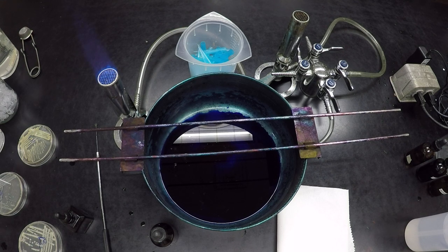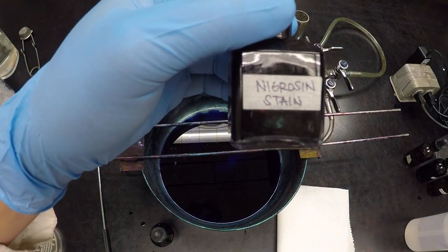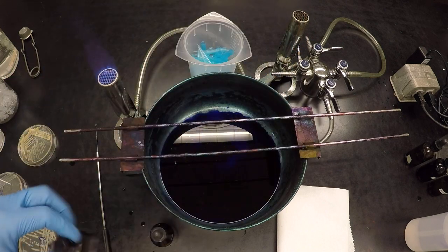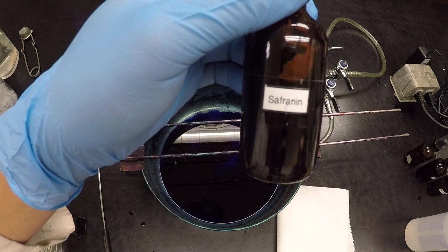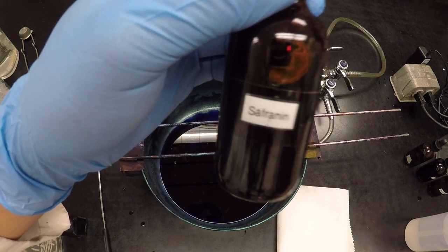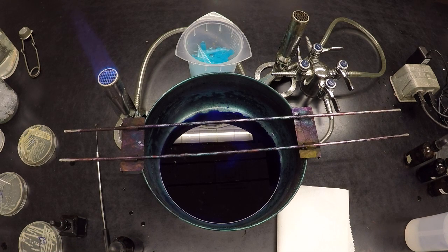Okay, so there's no real primary stain here. All we have is the background stain, and for that we're going to use nigrosin. It's a very coarse stain. It doesn't color the cells, right? So it basically colors everything but the cells. And then our counter stain, safranin, which should color the cells, right? So what we're going to end up with is a black background, red cells inside that black background, and then a nice little white halo around that cell that indicates presence of a capsule, right? And if the red cells are right in the black background, then that's no capsule.